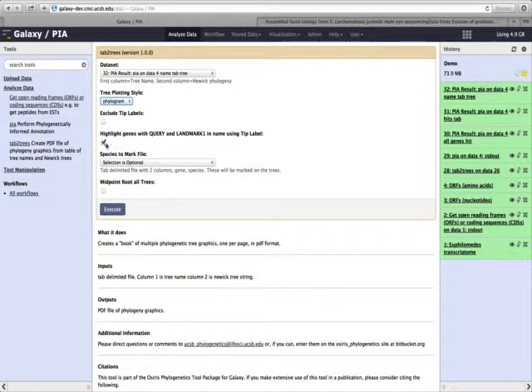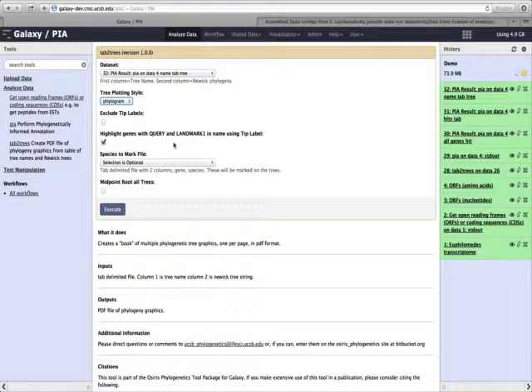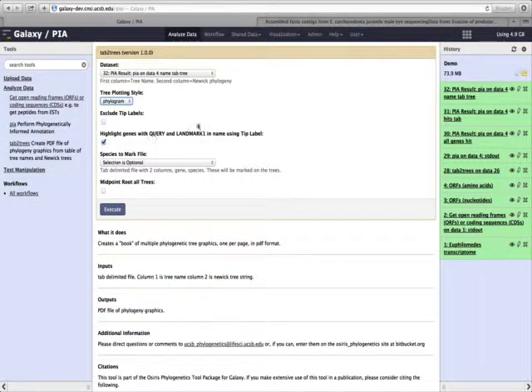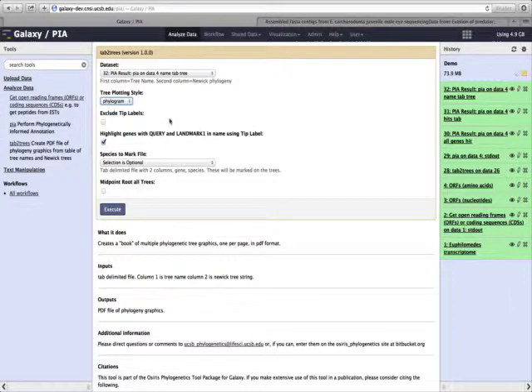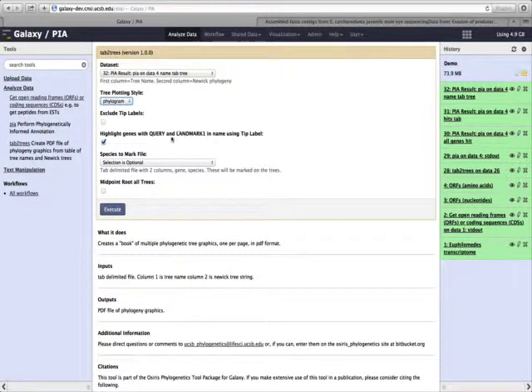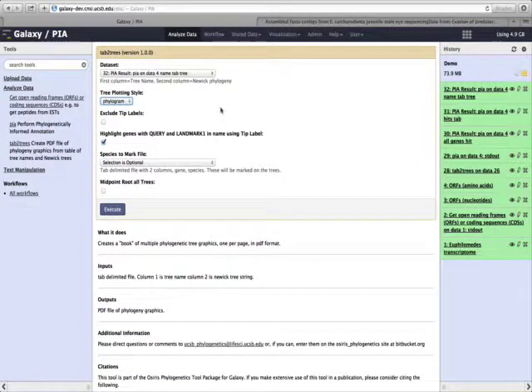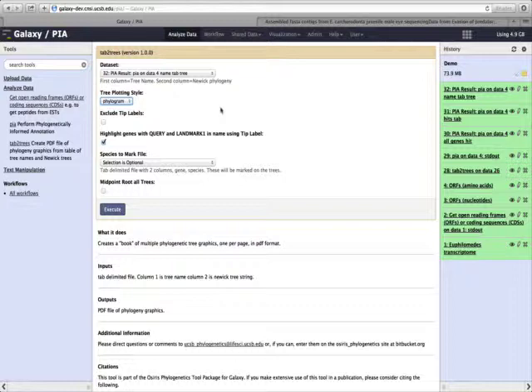We can decide whether or not we want to highlight genes that have the name query or the name landmark using labels. This is important for PIA because queries are genes that are hit by our BLAST parameters and placed within the phylogenetic tree. And landmark are genes that are functionally well understood and occur within our gene trees.